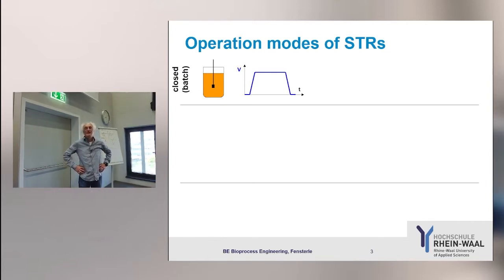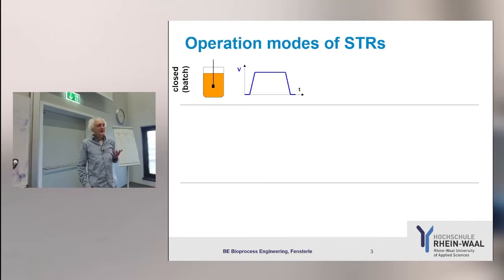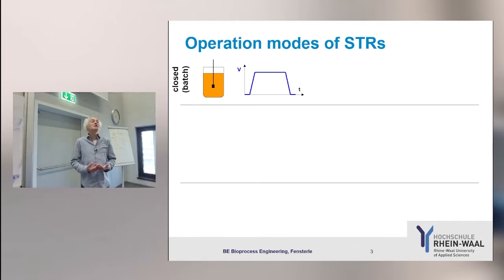I just have an assumption. I'm not entirely sure, but I think gas is still able to enter. We still have a gas inlet and outlet. Gas, exactly. So the gas in-out we still have, and therefore it's not completely closed. But we don't care about gas.